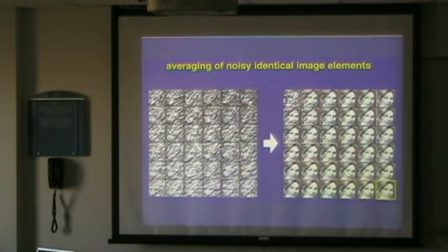Now, obviously, if this woman would make different faces each time, or look in different directions, I would get a mess. It seems very logical if you speak in terms of a face, but in terms of a molecule, you never know. Molecules can be flexible. Molecules can be in different positions, even if you think they are in the right position. They may not necessarily be. And you don't really have this directly under control sometimes. So you always have to be aware of the fact that you get these kinds of artifacts in your reconstructions.